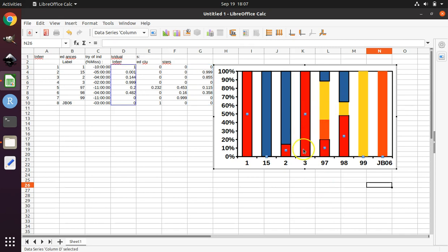This one's already been done. This one's been done. Let's move on to this color here. So you can see that I have all of the individuals, their segments that are that ancestor highlighted together. I'll come back to the original one, very carefully double click on it.